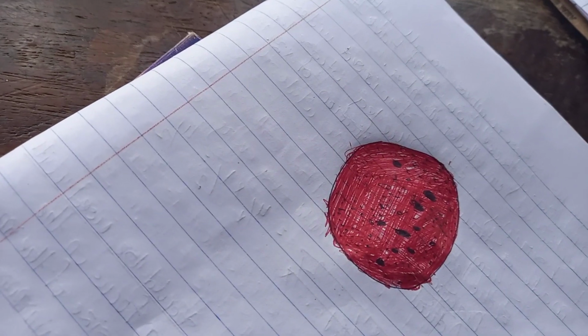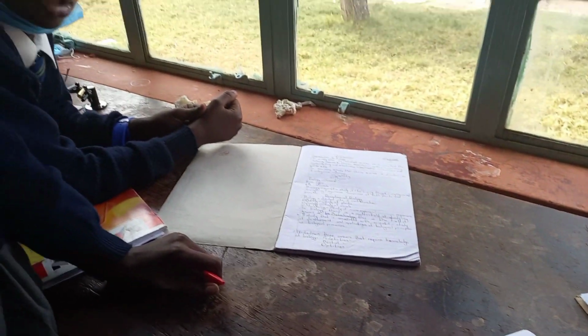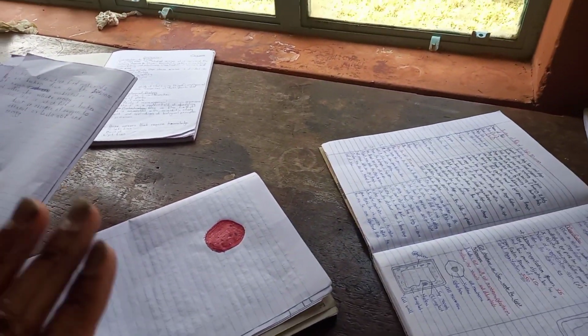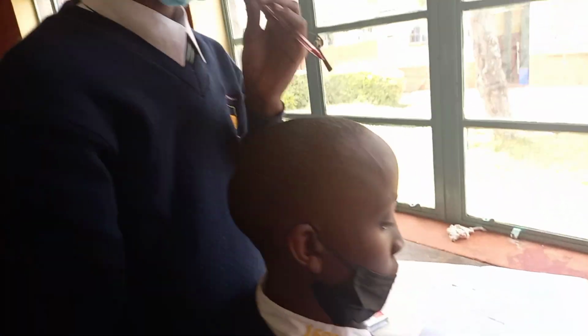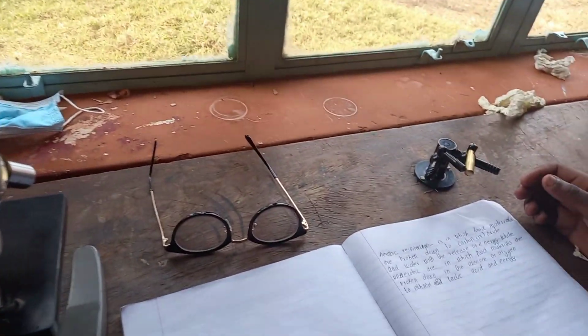For beginners, that's okay. It was red. In biology, we do not shade. Yes, it's red, that's okay, but don't put the red colors. Do not shade. You're still learning. Let us see the red one under the microscope. What is this red one?